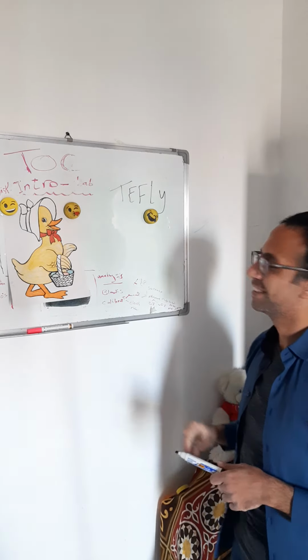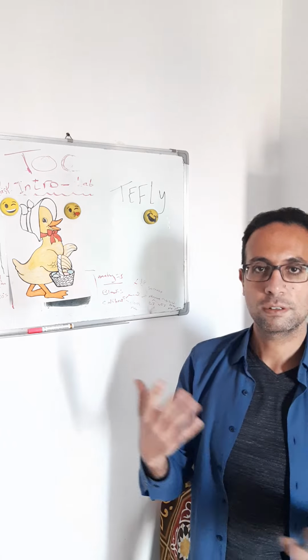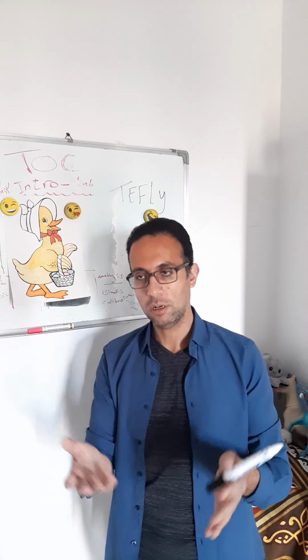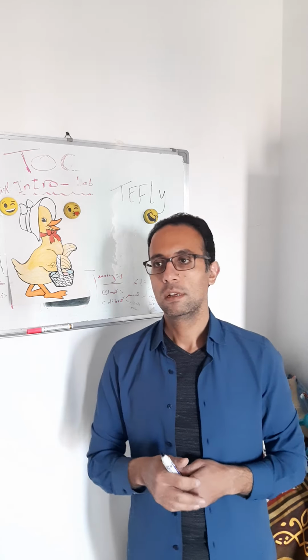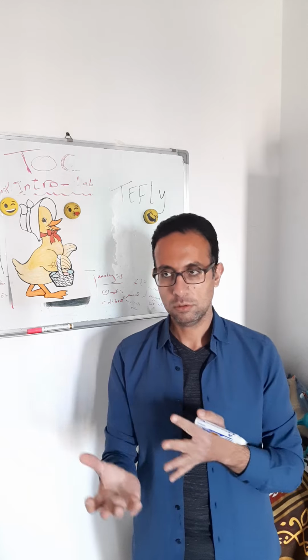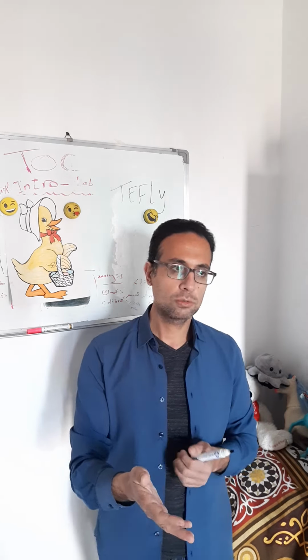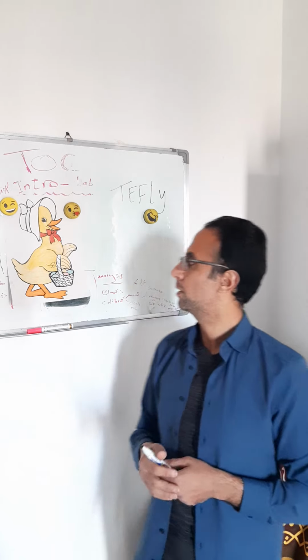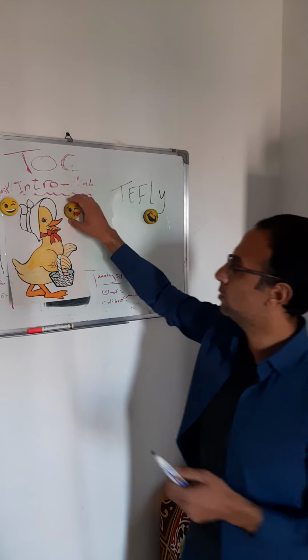So what can you expect, supposing you have at least started working in the field of laboratories? This video is considered to be specific, but we are also trying together to make it simple. So we are talking about TOC.